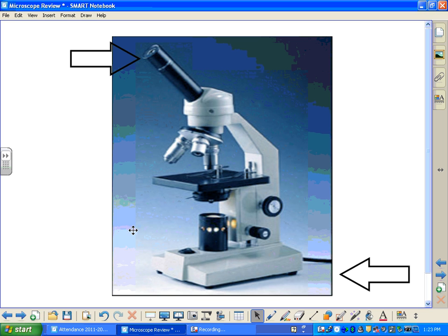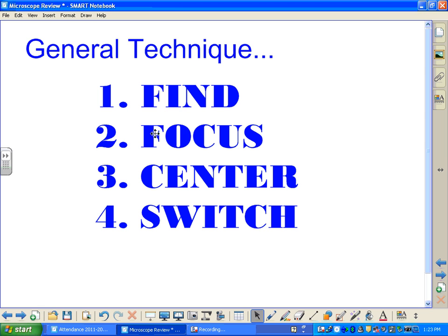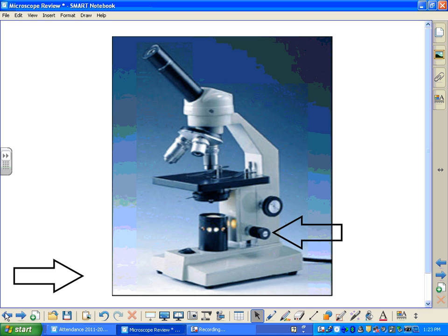If your specimen is blurry, you would go ahead and use your coarse adjustment and fine adjustment to bring the specimen into focus. Once you've found it and focused on it, the next step is to center your specimen. We would move around our slide until at least one of our little cells was in the center area. In this case, we've got some in the center, so we're going to move on to the next power.